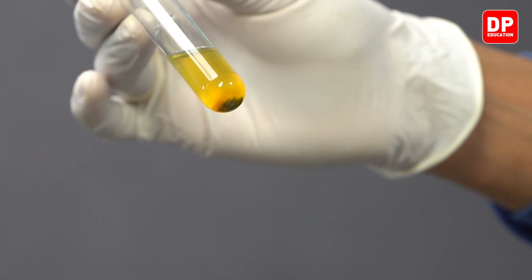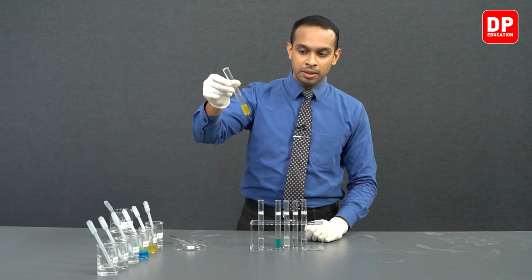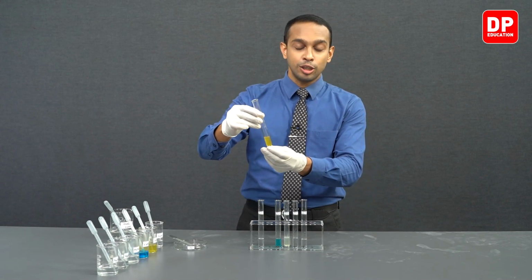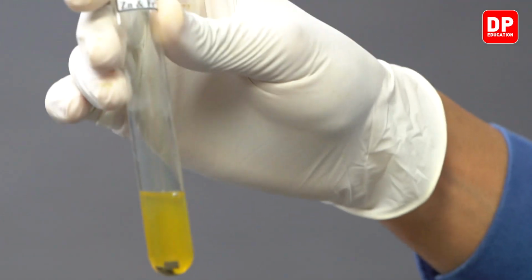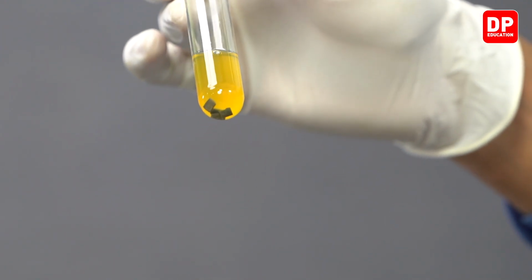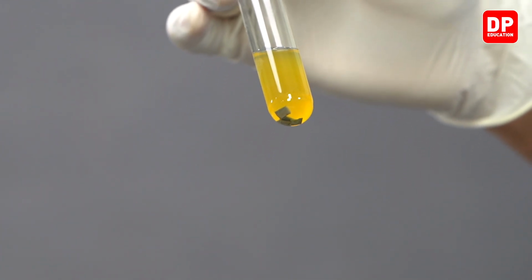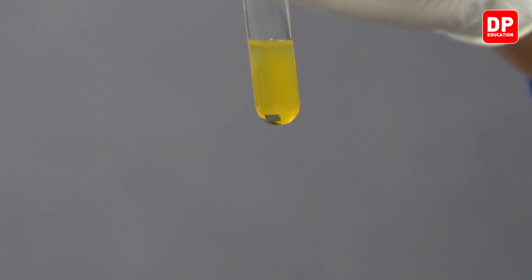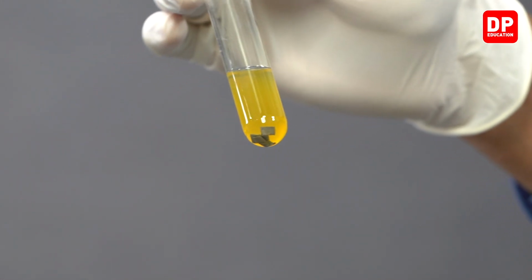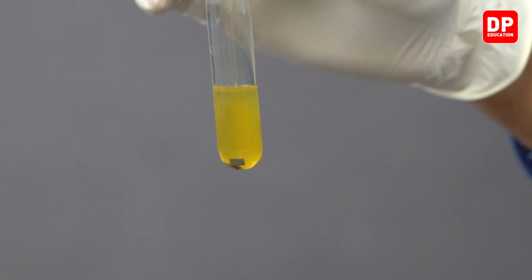You can see there are some precipitate particles accumulated at the bottom. If you mix it well, you will see a slight color change, and the small solid particles you observe here are not very visible to the camera, but they are very tiny iron particles that are displaced by zinc. So zinc has shown a reaction between Fe2+ aqueous ions and the zinc solid.